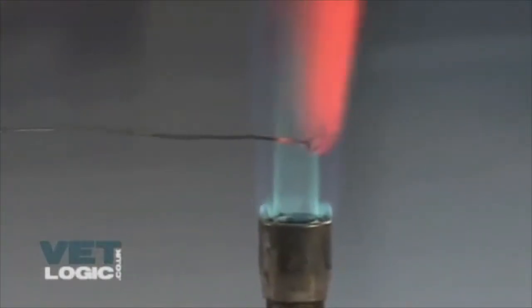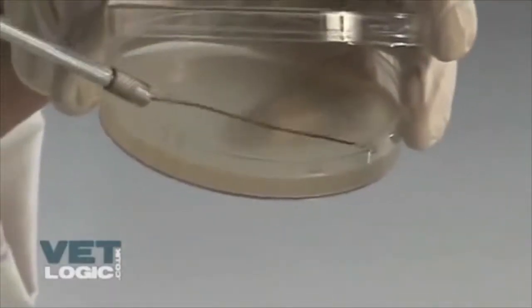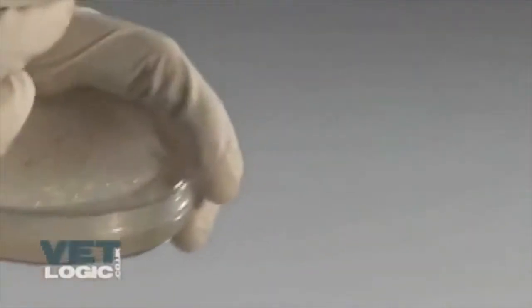Heat a metal loop in the blue Bunsen flame until it glows red. Using the loop, make a second well by drawing bacteria from the inoculation well.